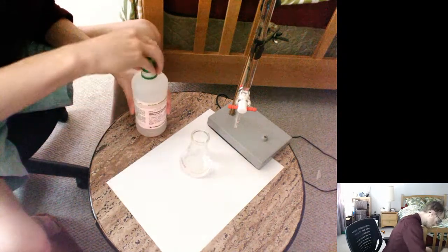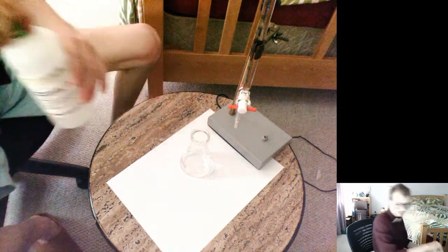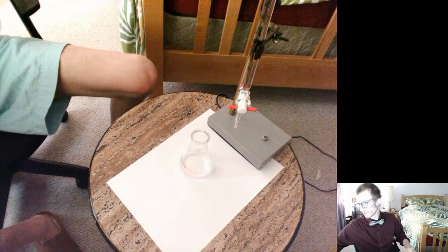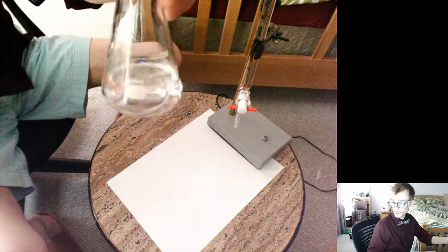You'll notice that immediately there's no color change, and that's because phenolphthalein only turns pink in the presence of a base. However, in our case, this is still an acid, so no color change. This just looks totally clear.